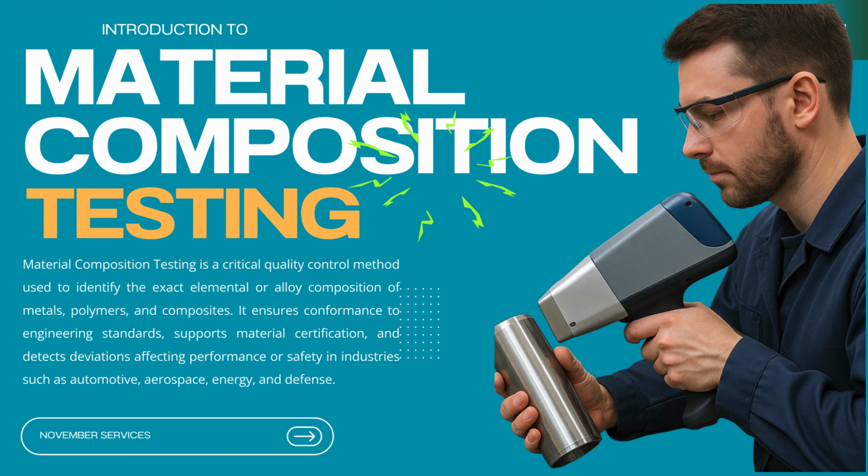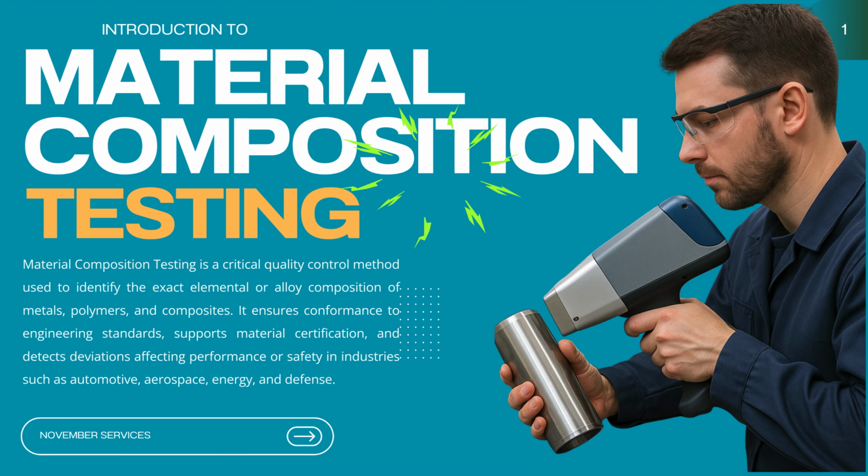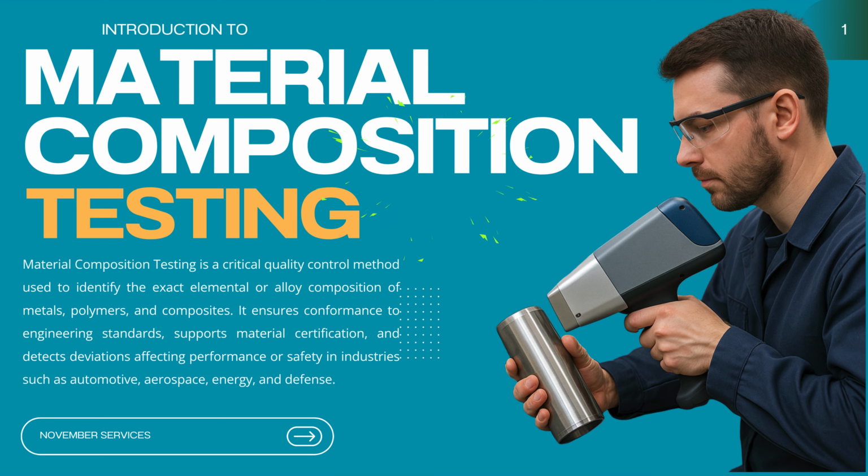Hello everyone. Let's begin with an introduction to material composition testing. This type of testing is fundamental in quality assurance and product validation. It allows us to determine the exact elemental makeup of a material, whether it's a metal, polymer, or composite. This is crucial for confirming if a material meets specific engineering and safety standards.